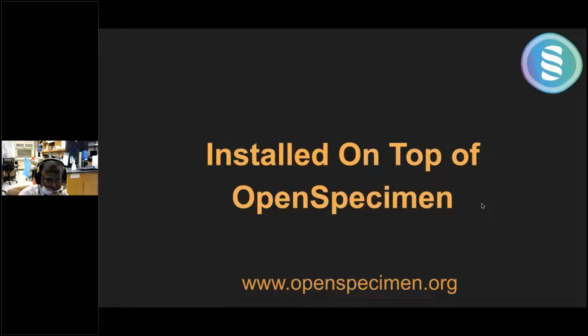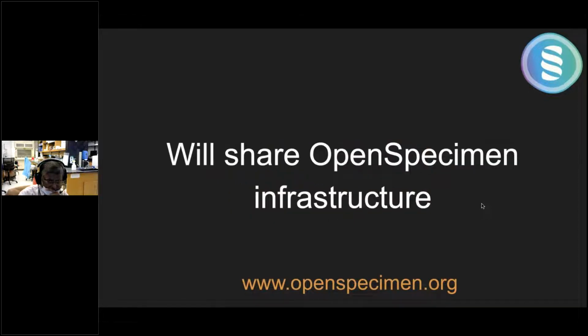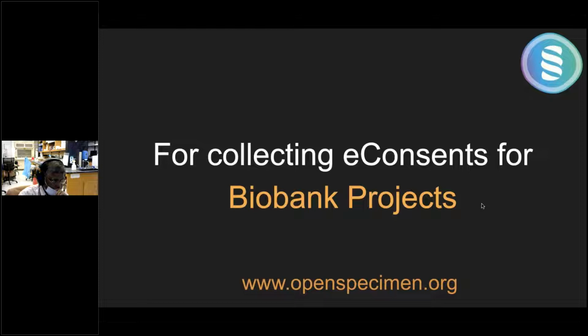Or you can install it on top of OpenSpecimen. That is, if you have an existing OpenSpecimen, it will share all the OpenSpecimen infrastructure. It is kind of a plugin on top of OpenSpecimen. Therefore, there is no need for additional infrastructure, VM servers, etc. And especially if you are doing eConsenting for your biobank projects, then it makes all the more reason to use it with OpenSpecimen.